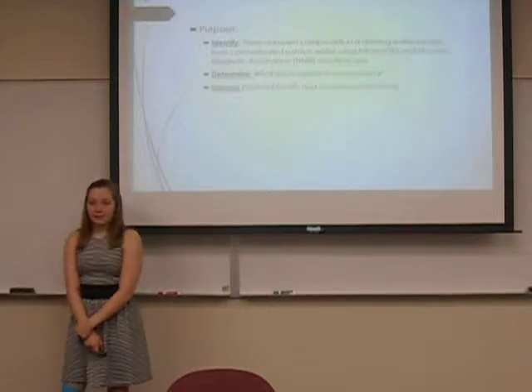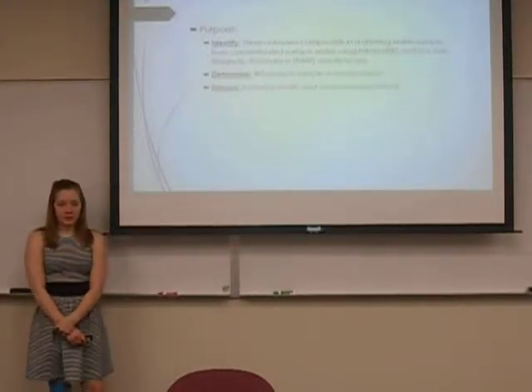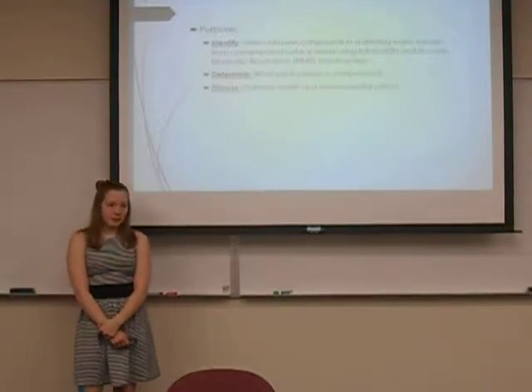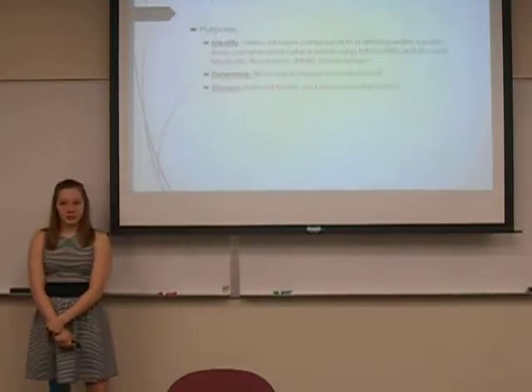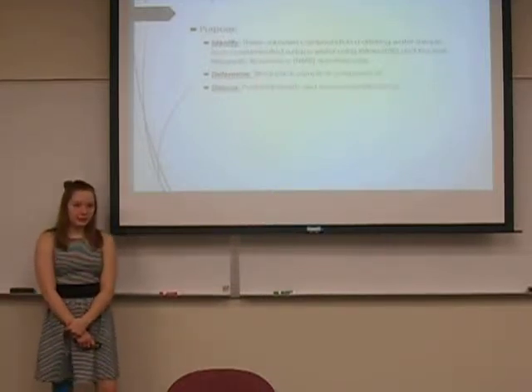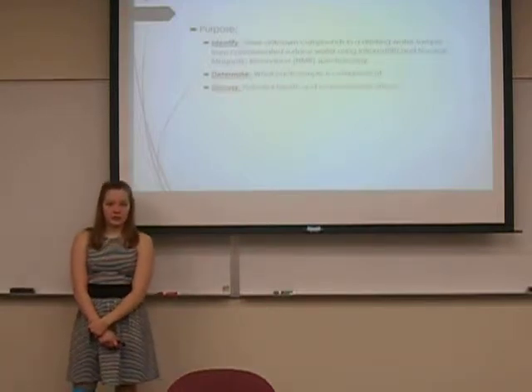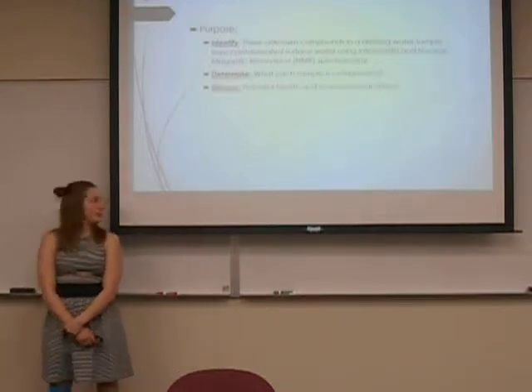First, we have to identify what each of these compounds are based on their IR and NMR spectroscopy. To do this, we will use these and find functional groups as well as ratio of areas and peaks to identify what these compounds are, and after we identify them, we will then be able to determine the environmental and health effects of each one of these.